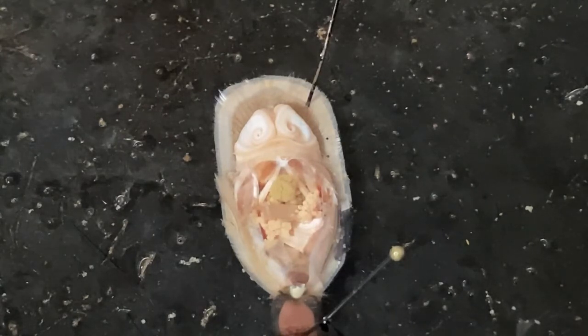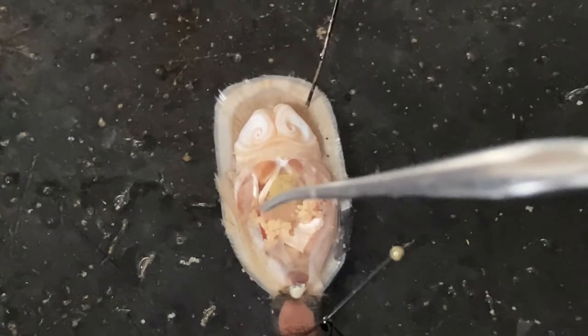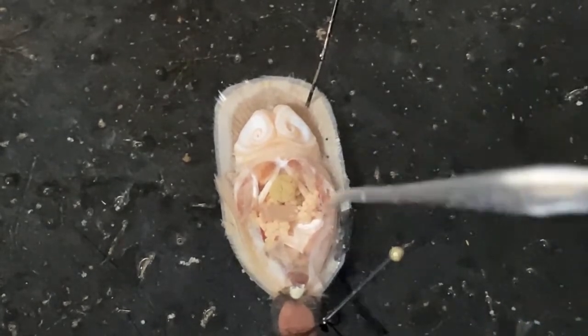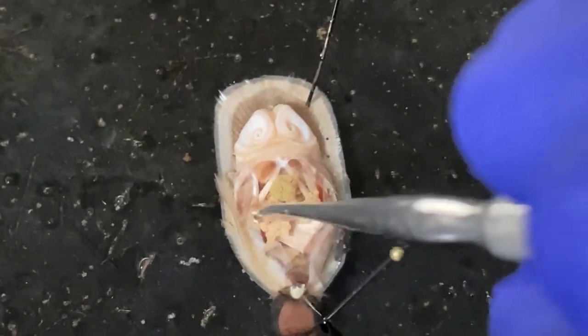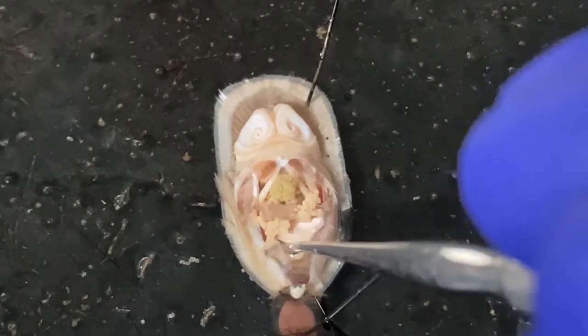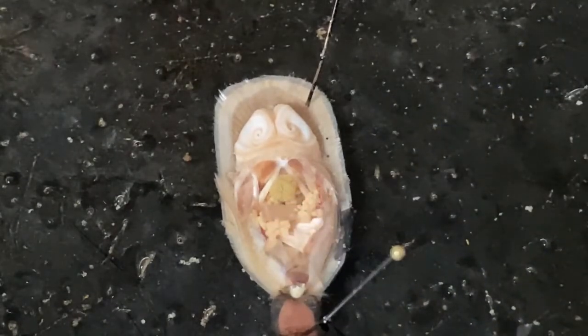Now other muscles that are found inside of these animals, there are three adjuster muscles. And these adjuster muscles, one is right here that attaches to the dorsal shell down underneath here someplace. This whitish one is another of these adjuster muscles. Broad muscle that attaches, its insertion is down here on the dorsal shell and up here on the ventral shell. And a third adjuster muscle is located right here. So these adjuster muscles keep the two shells oriented to one another, and they can contract them and slightly adjust the shells side to side. So the adductor muscles pull the shells together. The adjuster muscles do exactly that. They adjust the shell orientations to one another.